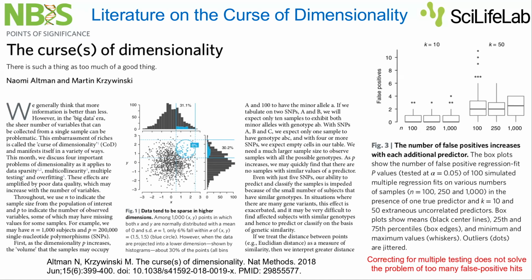And one way to overcome the curse of dimensionality is actually to do dimensionality reduction. So that's the motivation why we are doing dimensionality reduction: not only to visualize our data, but also to overcome the curse of dimensionality.